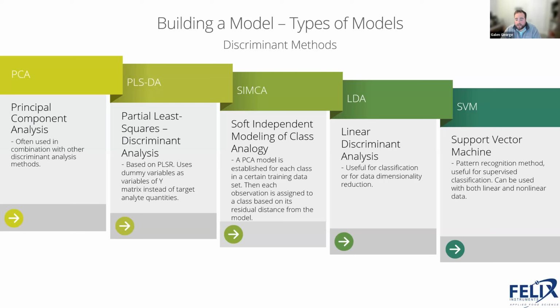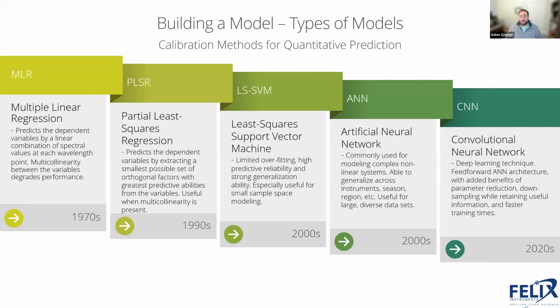So there's been a progression of what kind of models are used the most in commercial agriculture and agricultural research when we're talking about NIR spectroscopy. So it acts as kind of a timeline, really, and also in that way helps guide us into what we should be looking for when we're choosing a methodology.